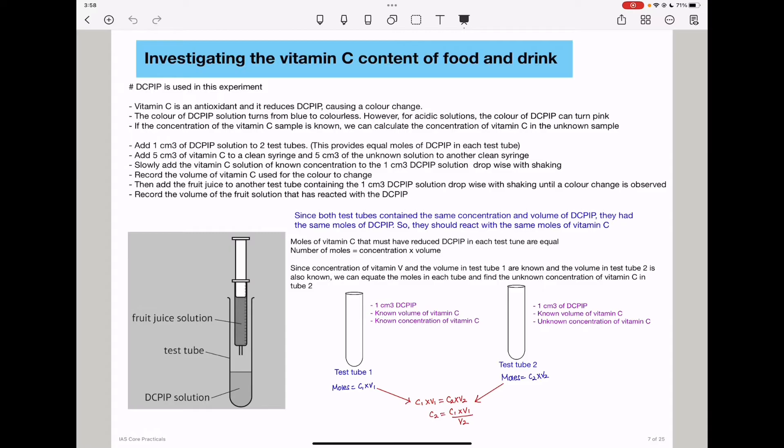In this experiment, DCPIP solution is used. We need to know that vitamin C is an antioxidant and it reduces DCPIP, causing a color change. When DCPIP is reduced, the color can change from blue to colorless.